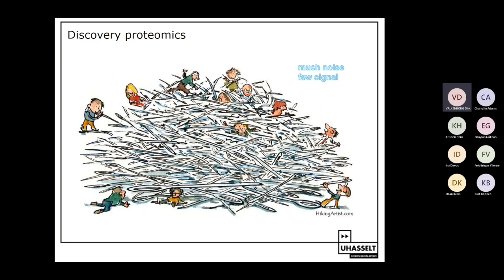I have given this lecture multiple times, also in coursework, and what students say afterwards is that there seems to be much noise in the data and little signal. That's exactly true, and that's why I have this cartoon on the slide, which indicates that looking for discovery proteomics is not looking for a needle in a haystack, but a needle in a stack of needles.